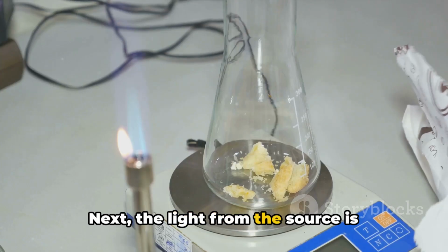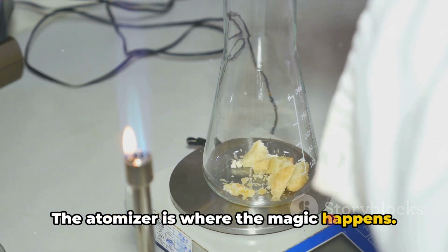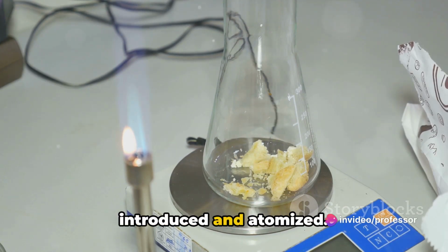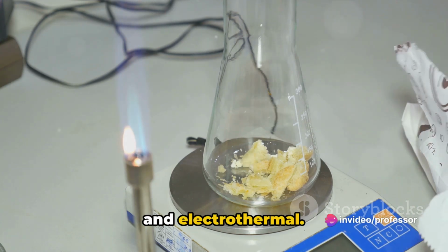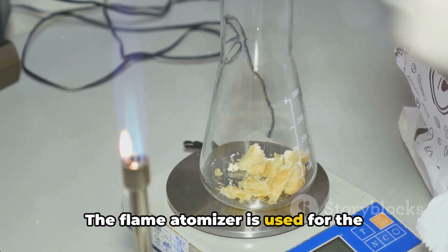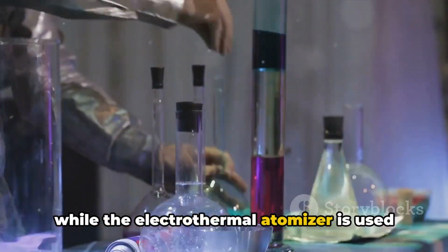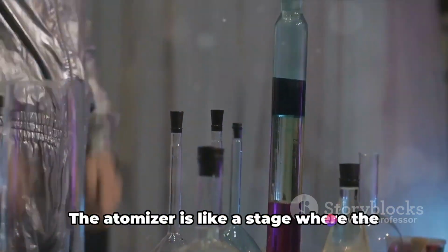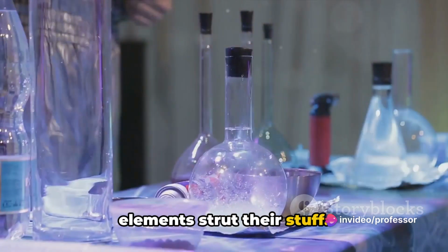Next, the light from the source is directed towards the atomizer. The atomizer is where the magic happens. It's a chamber where the sample is introduced and atomized. There are two types of atomizers, flame and electrothermal. The flame atomizer is used for the analysis of major and minor elements, while the electrothermal atomizer is used for trace element analysis. The atomizer is like a stage where the elements strut their stuff.